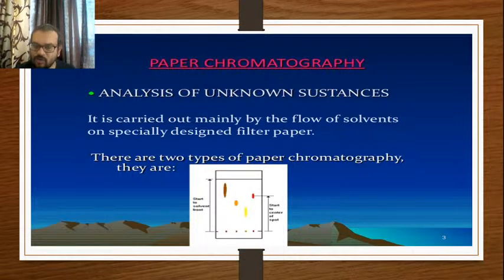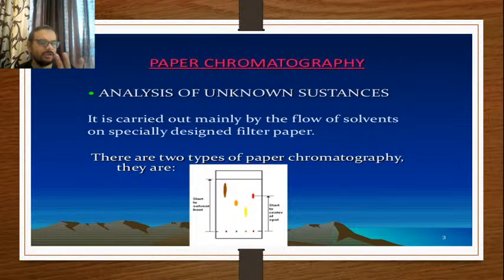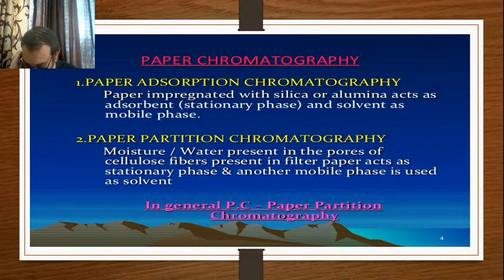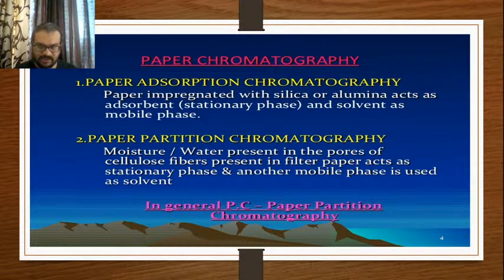But there are two ways to classify chromatographic techniques, depending upon the principle by which the separation occurs. We have already dealt with it. And there are the developmental techniques by which paper chromatographic techniques have been developed. So the first one is the principle by which the technique has been developed: paper adsorption chromatography and paper partition chromatography. No need to explain what the basis of classification should be.